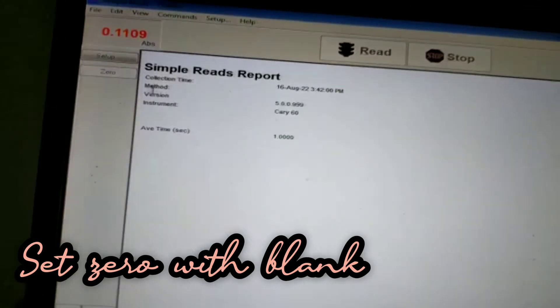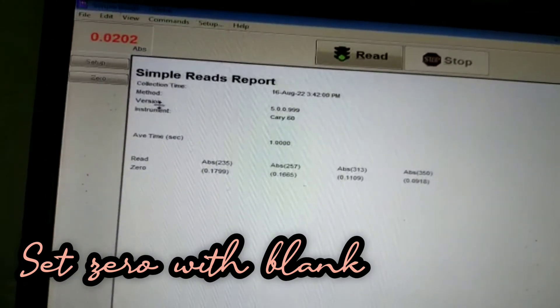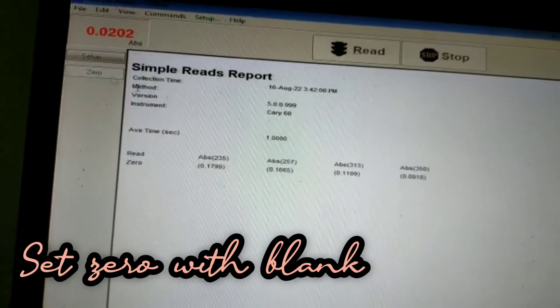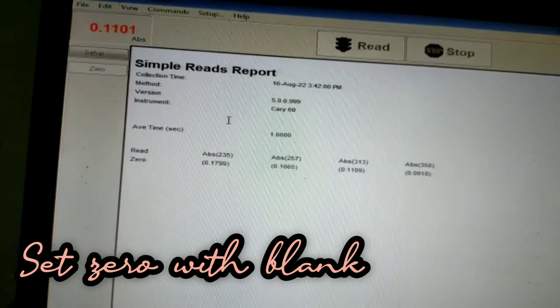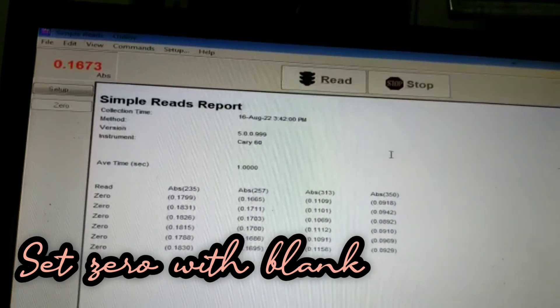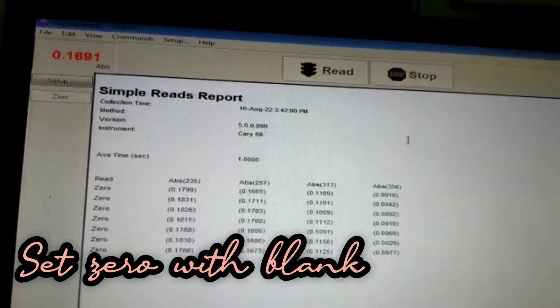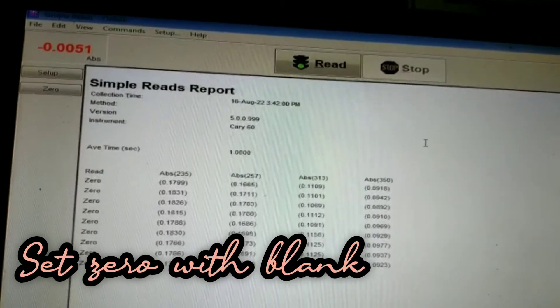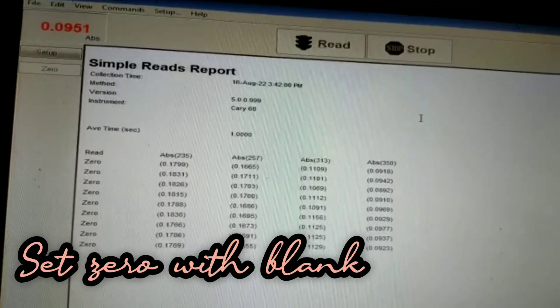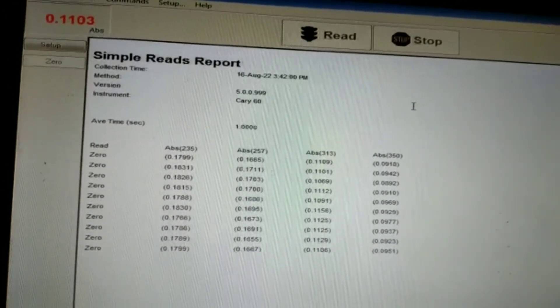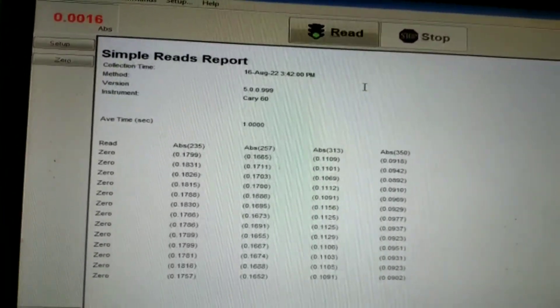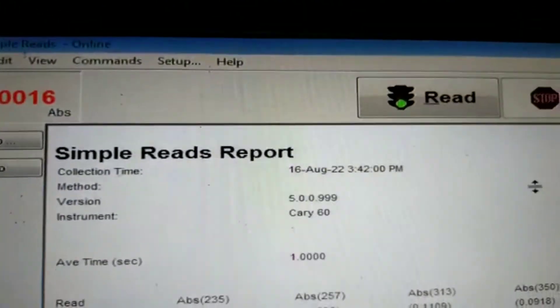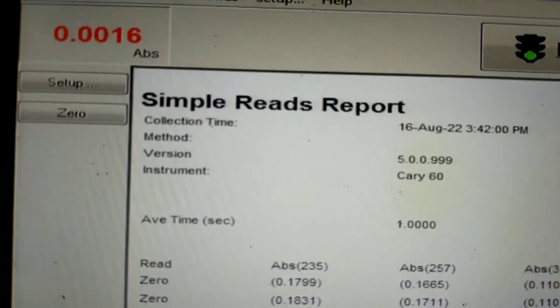I continuously press zero until the red color measurement shown on the top reads zero. Now you can see it is set to zero with the blank, that is sulfuric acid.